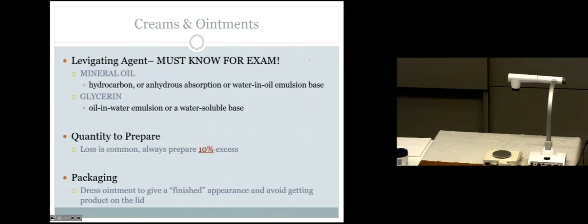And the last thing today, the last two steps in your procedure that you're going to write, and in fact have to do, is when you transfer all of your product into, and for once we're not using weigh boats, ointment jars. Judy will show you how to do this.